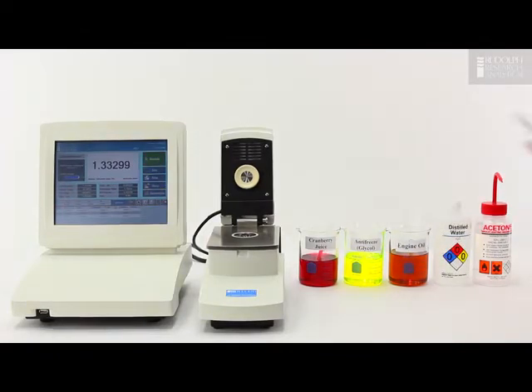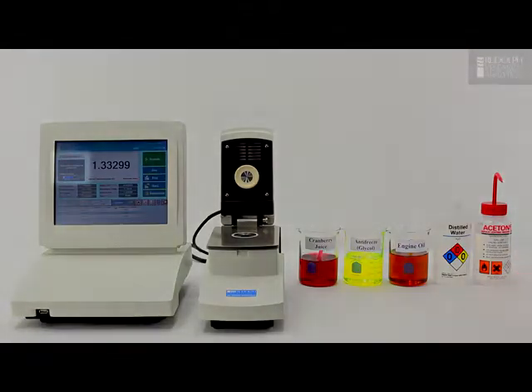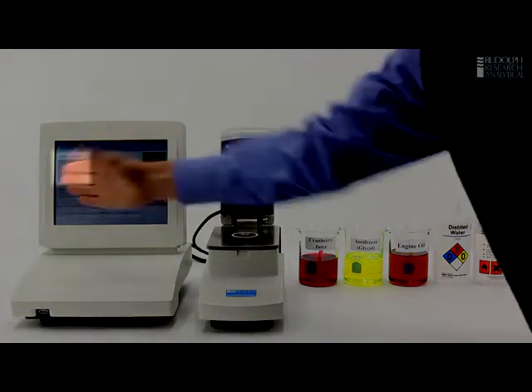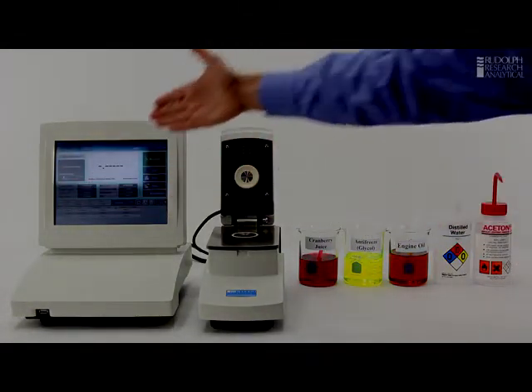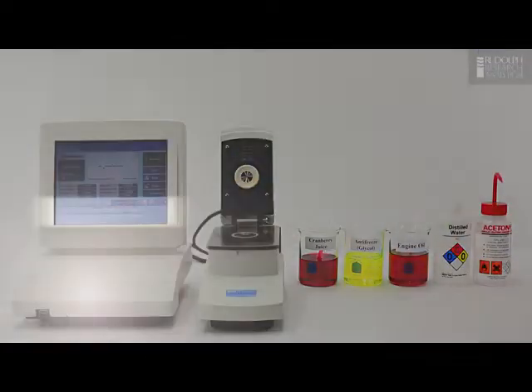Now that I've completed the measurement I'll wipe away the sample. The instrument has been designed with a very shallow sample well to make it very easy to clean. The smart measure system detects that the sample is gone, blanks the main reading, but the readings are still kept here and now we know it's ready for the next sample.